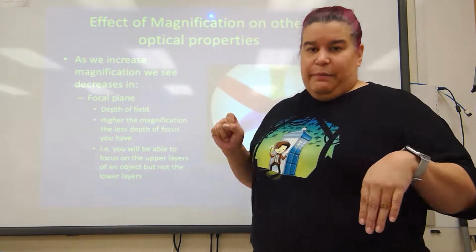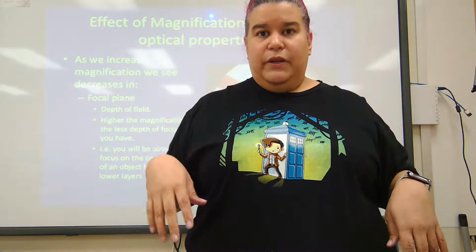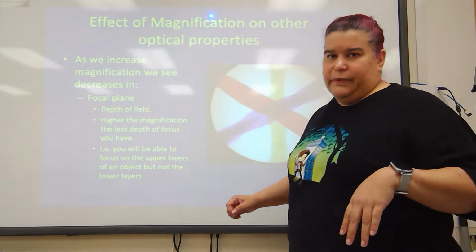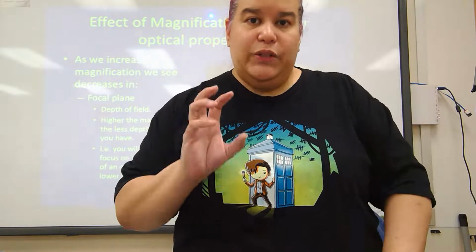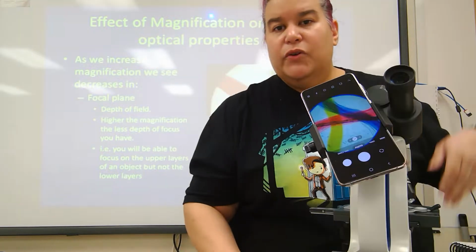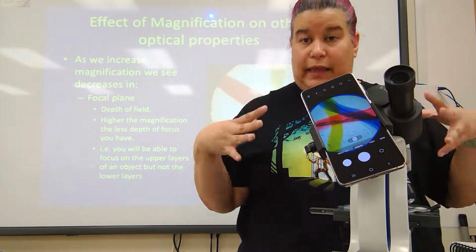The classic example of this is the silk threads slide. You have a red thread, a blue thread, and a yellow thread. And as you focus the scope, you will see each one individually. So here's that classic three silk string slide.